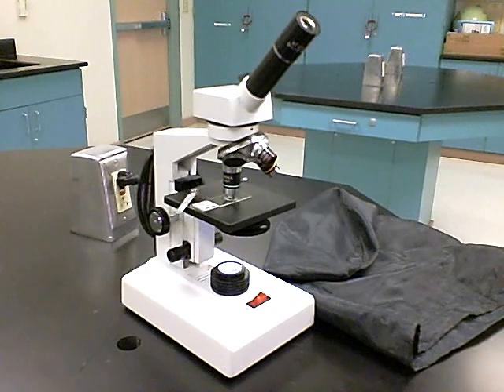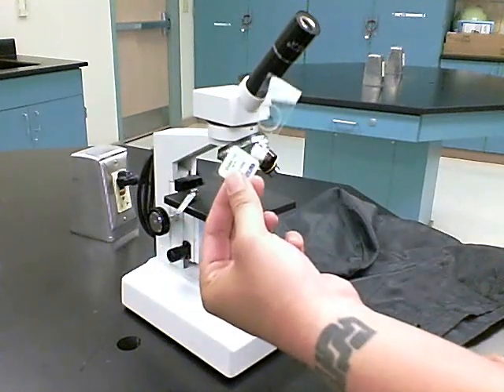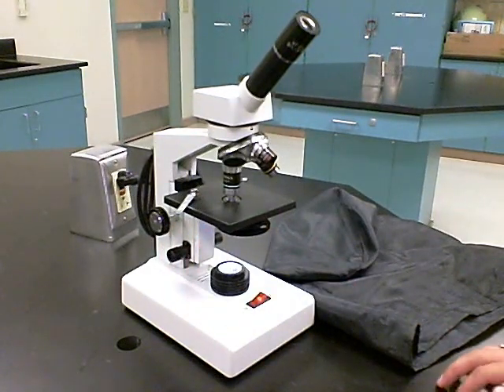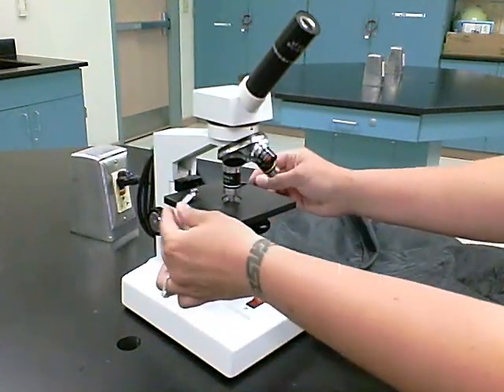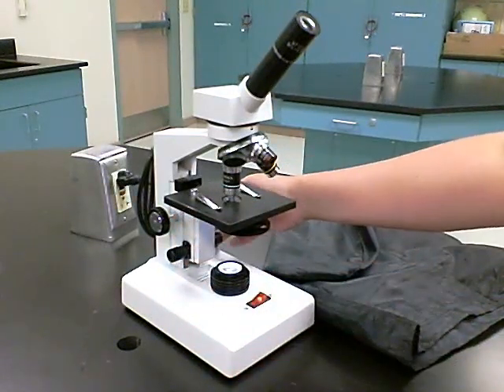Once you're finished viewing your slide, of course you want to put your microscope away appropriately. The first thing you want to do is remove your slide from the stage, and you want to make sure your stage clips are back in the appropriate position so they're not hanging off the side.